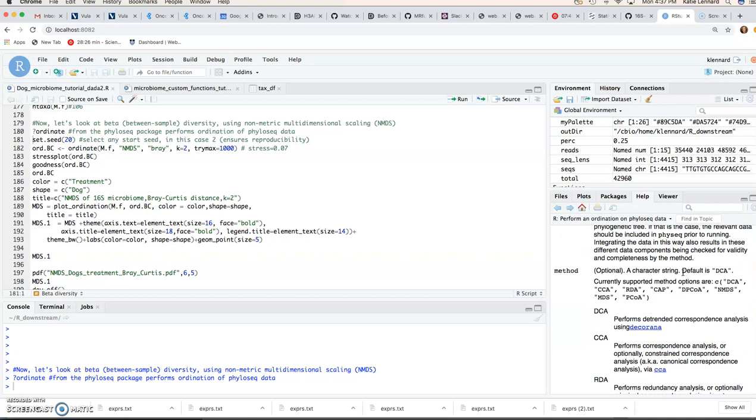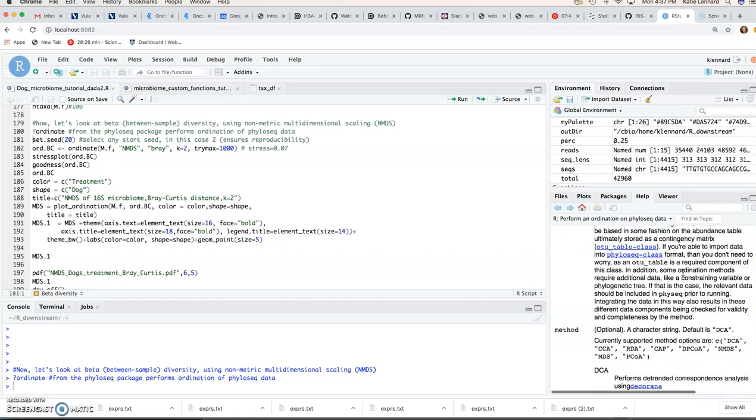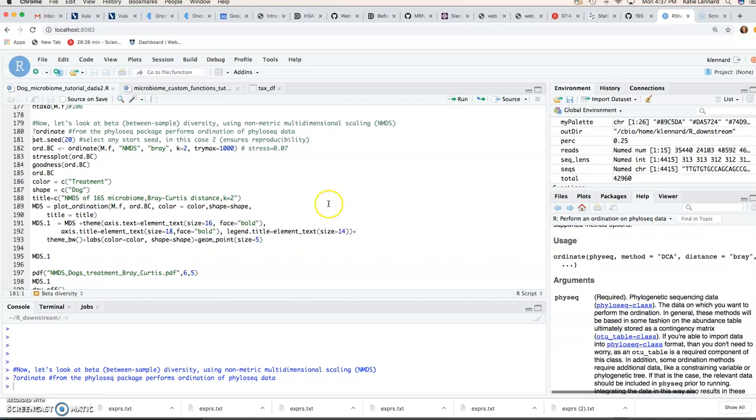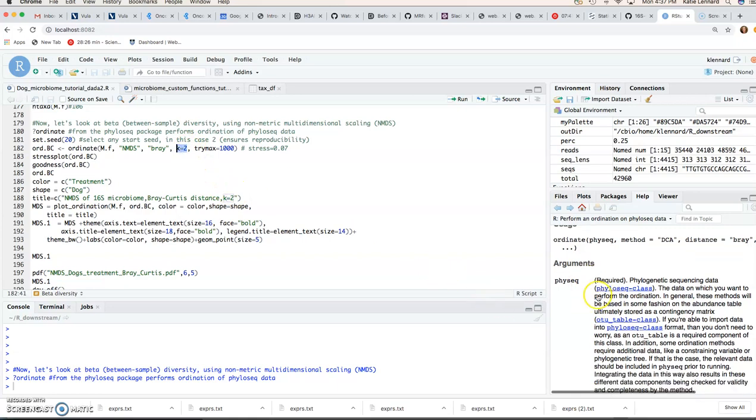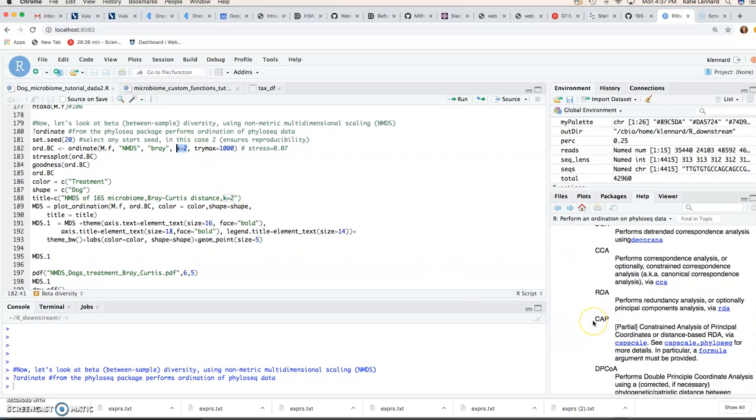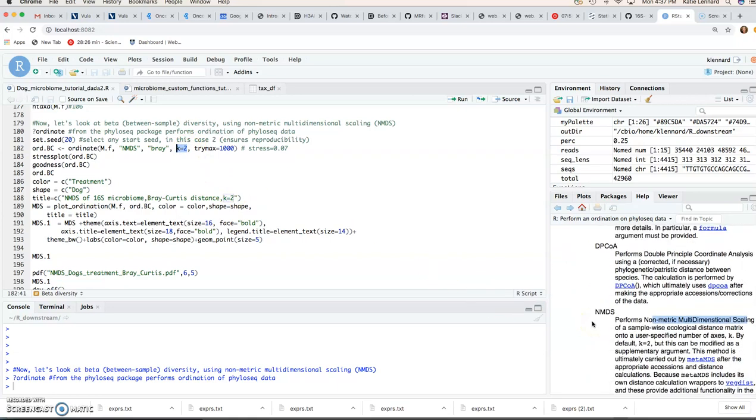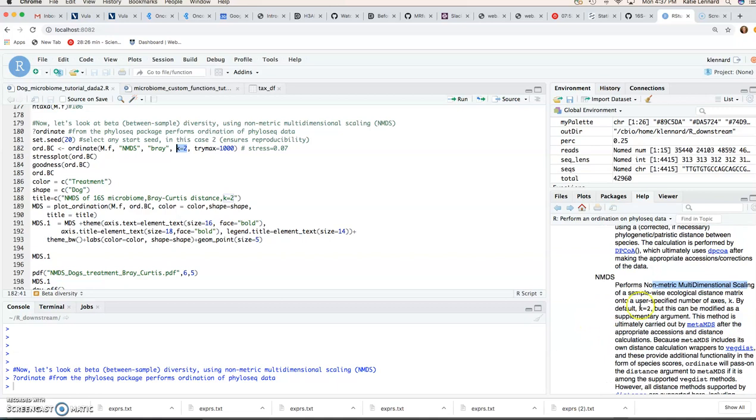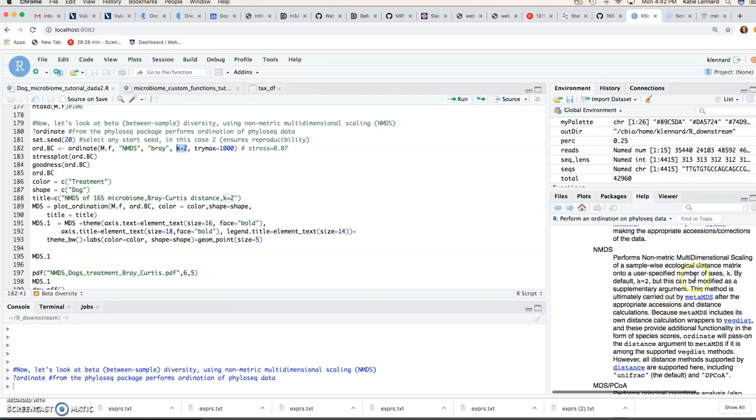Other thing that we need to specify for our parameters is K. So that's the number of dimensions you want to use. That, by default, is 2, and you can also adjust that K parameter. You may have to if you don't find a convergent solution. So in that case, you could maybe make K3 and see if that solves the problem.